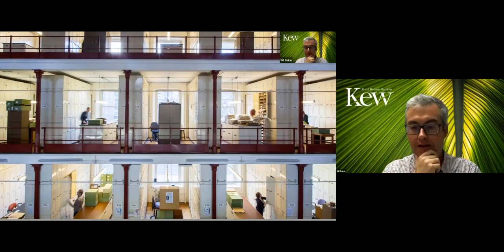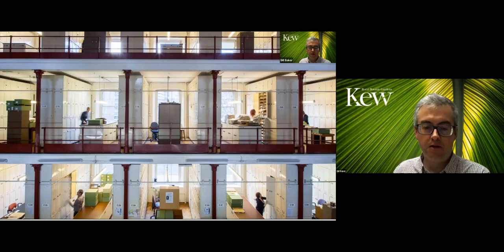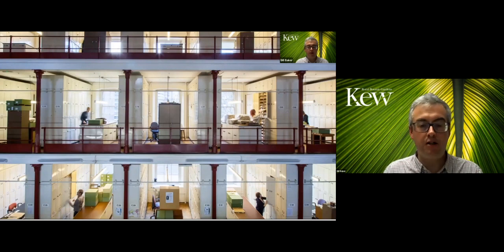This is just a shot of an active day in one of the wings of the Kew Herbarium. Our team is running around this building, trying to locate the best possible samples, the most accurately identified material that looks most likely to yield good results. And we're extracting DNA like crazy. We procured major sequencing services. In fact, compared to the previous phase, we'll be outsourcing a lot of the molecular biology. So we are on the verge of starting a major splurge of data generation right now.